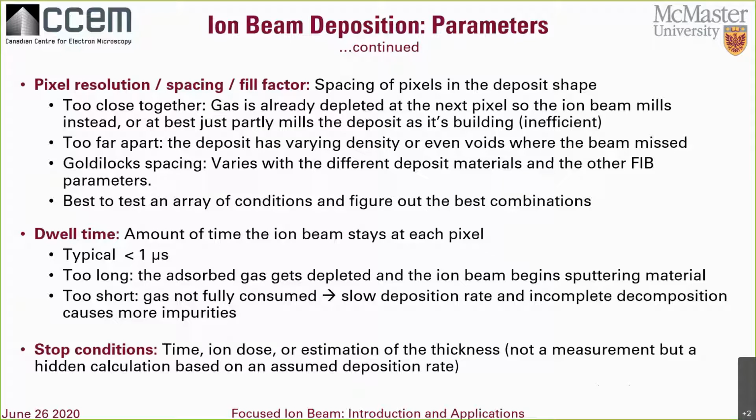But optimizing it, you just want to blast it with the highest current possible, as long as your sample can handle that. That's really the most important thing. And don't go too high with the voltage. It tends not to work as well, unless you need to penetrate into pores or something like that. So a somewhat low voltage is good.